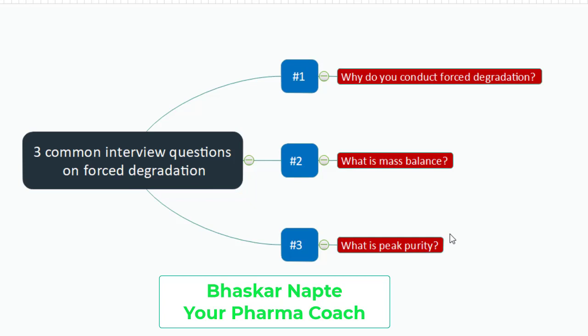So we are at: what are the reasons for the mass balance failure? Study about it. It can be about the different response for the degradants than the API. What you are assuming, practically, ideally, is that the response is going to be similar. But is that the actual practical case? The response of degradation products can be lower or can be higher as compared to your drug substance or the API. So this is the number one reason why you can have a lower or higher mass balance.